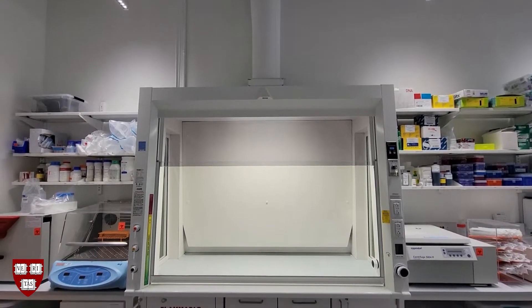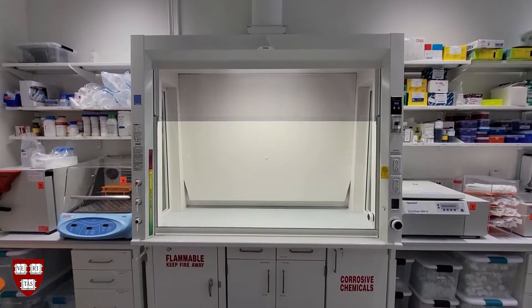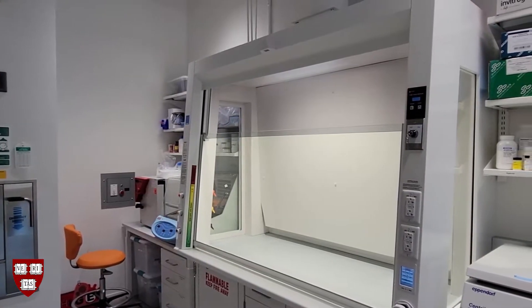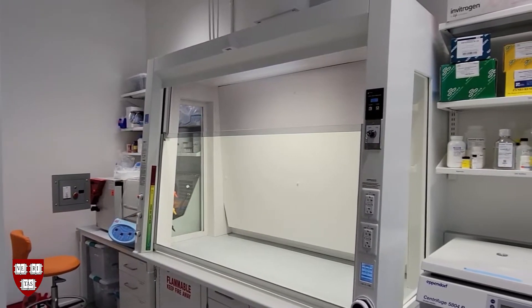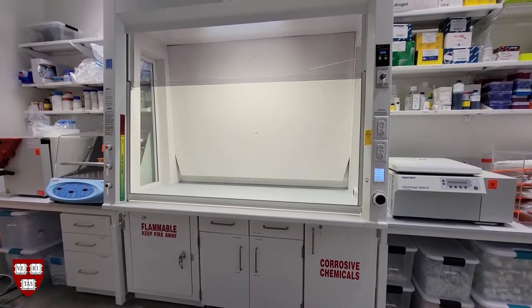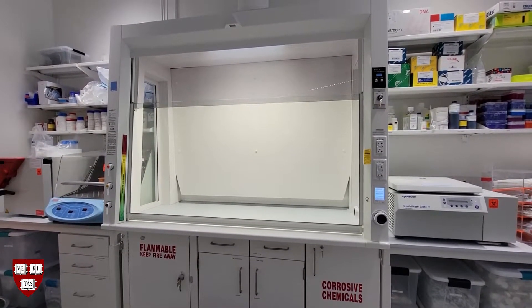Laboratory fume hoods are a great way to protect yourself from chemicals you work with, but you need to use them properly for them to work well. The following information pertains to the sash operator to automatic fume hood. These fume hoods are common in the Harvard Science and Engineering Complex but are present in other labs across campus as well.